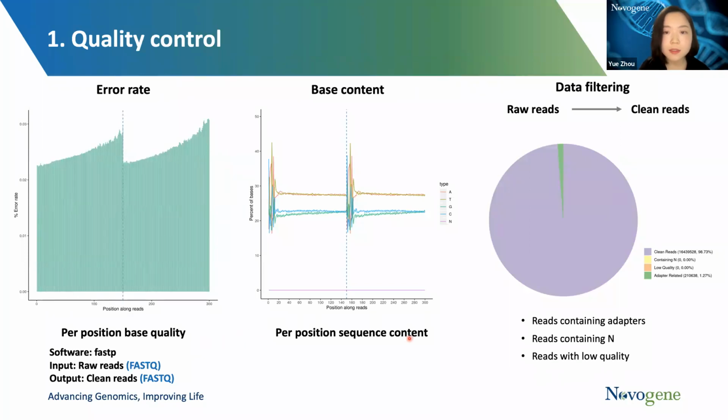For GC content, we're looking at different things, such as no separation of GC, no split at the end, and no fluctuation. We also know that a large variation in the first 6 to 7 bases is allowed, considering the usage of random primers in the library preparation.